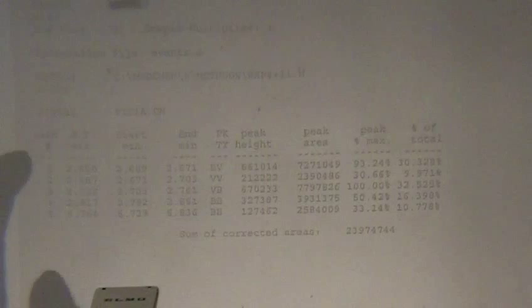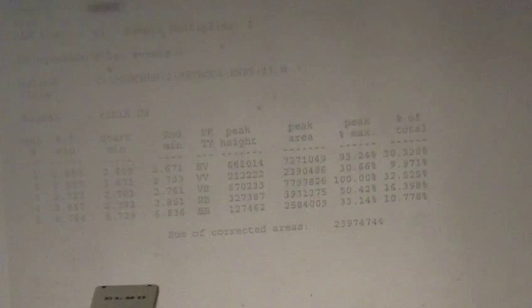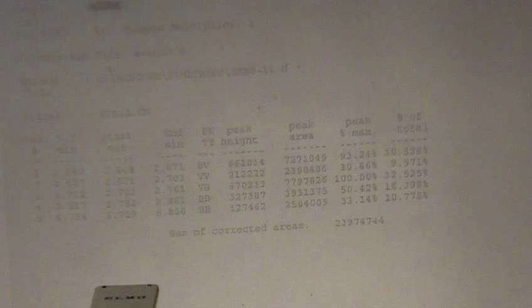From this, we're going to give you a list of retention times that tells you this compound comes off at this specific retention time. So you use these retention times to figure out what the compounds are. Now, for all of the alcohols, we can't give you all the alkene possibilities. So the standard retention times list that we're going to give you, and it'll be specific to your lab section, will be for a certain set of retention times.